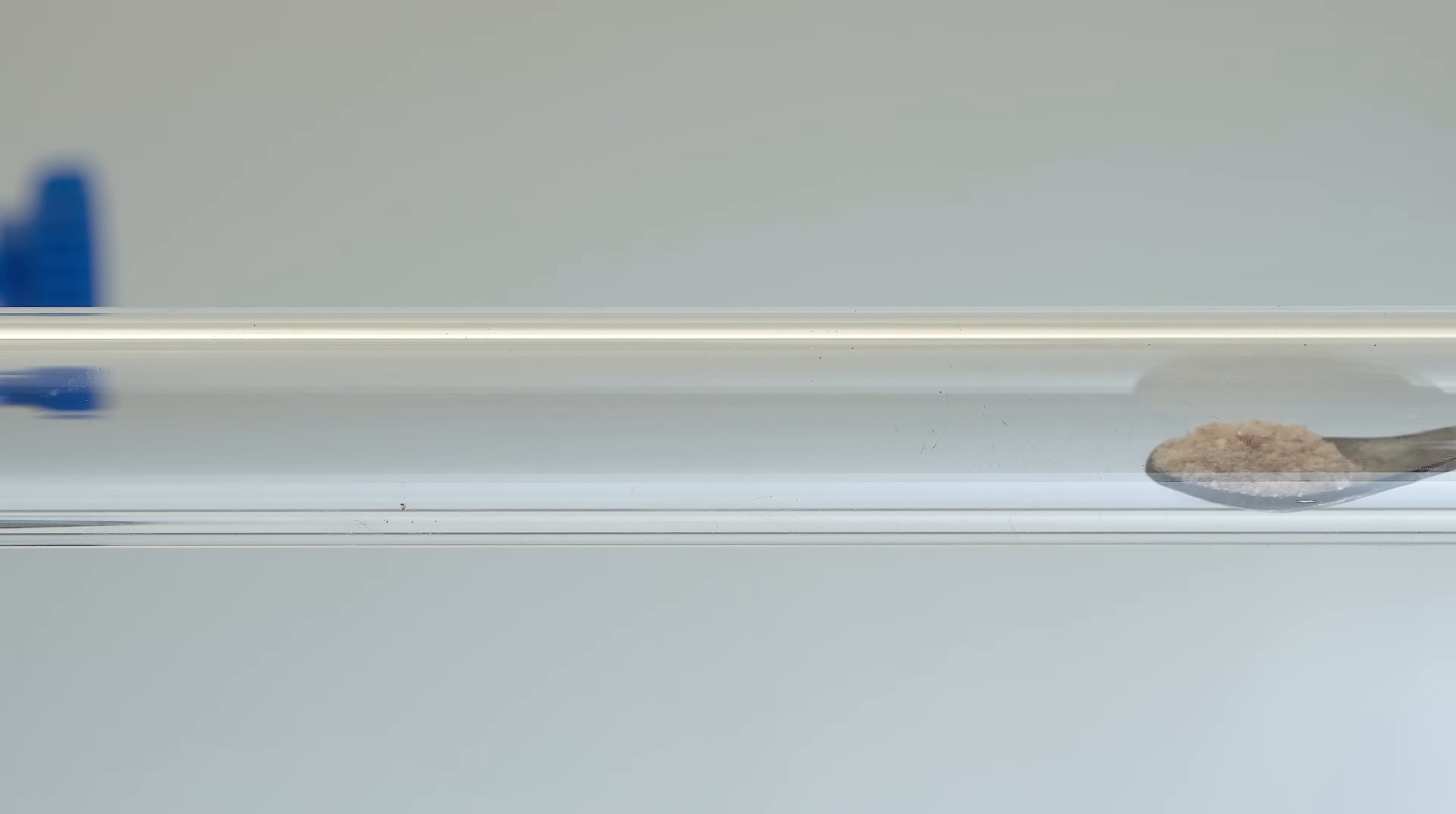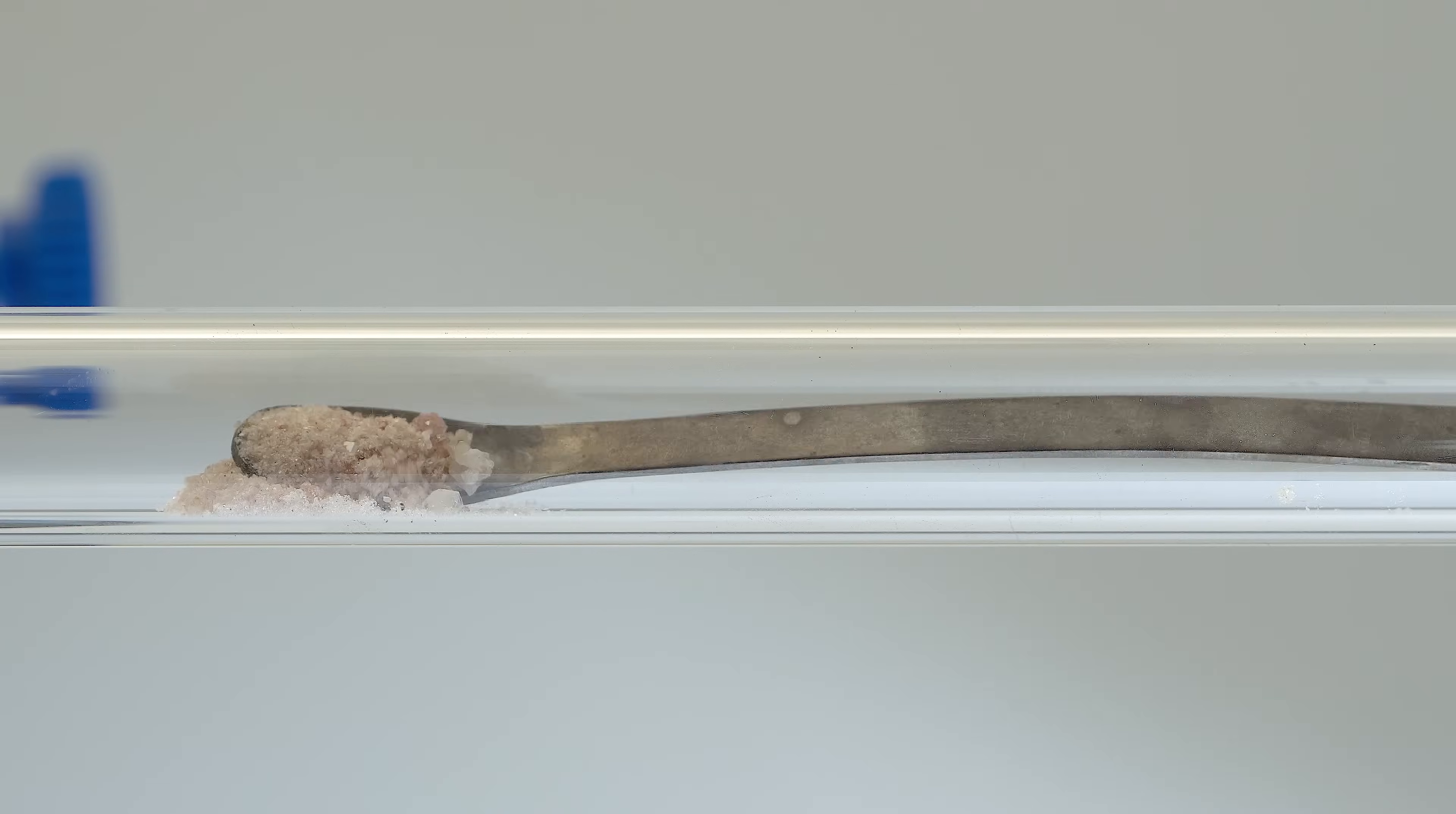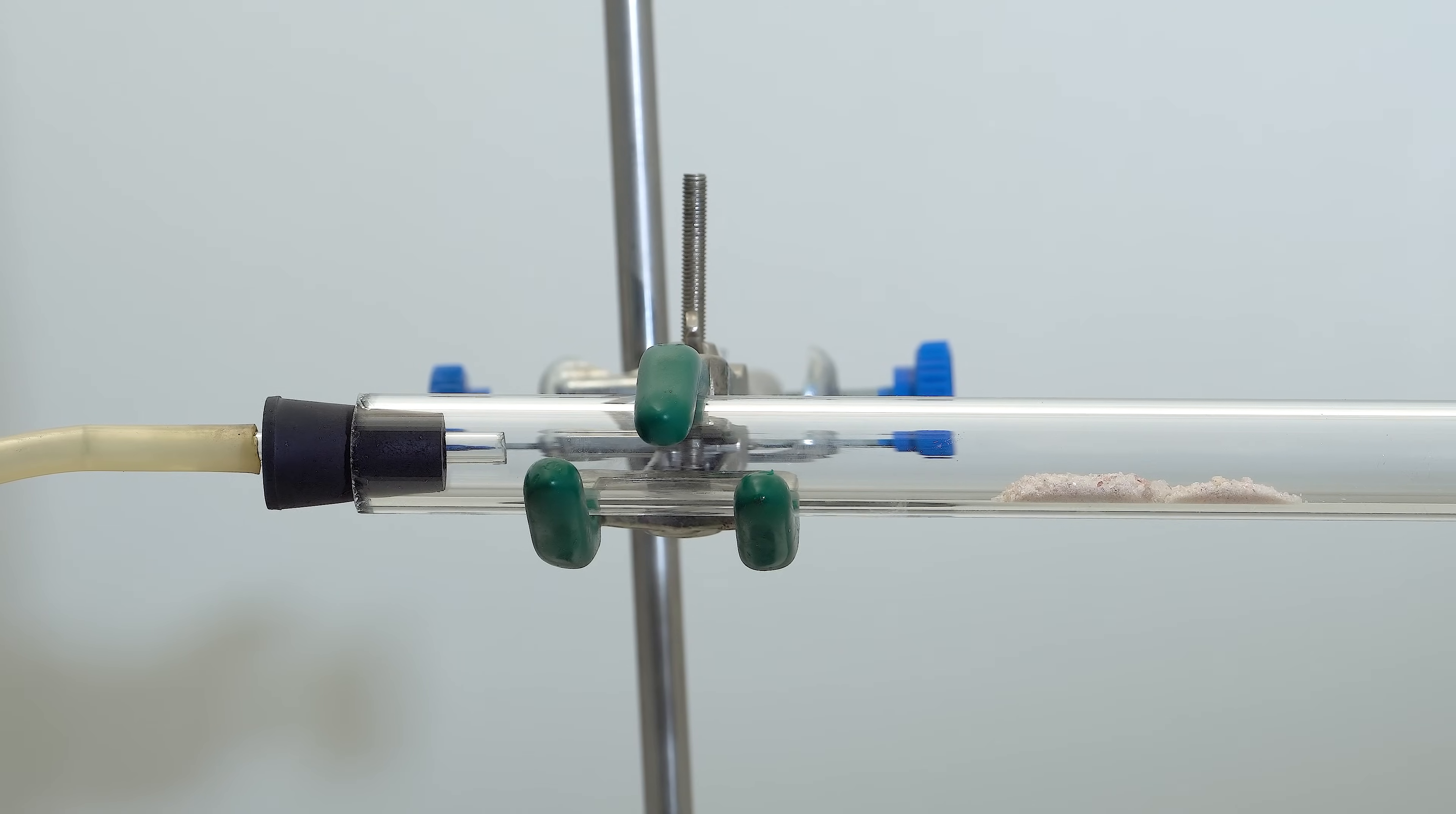The first reaction to obtain a tungsten mirror is the simplest. You just need to heat the tungsten hexacarbonyl in an inert gas atmosphere. Normally, tungsten hexacarbonyl appears as a white powder, but prolonged storage can cause it to take on a pink hue.